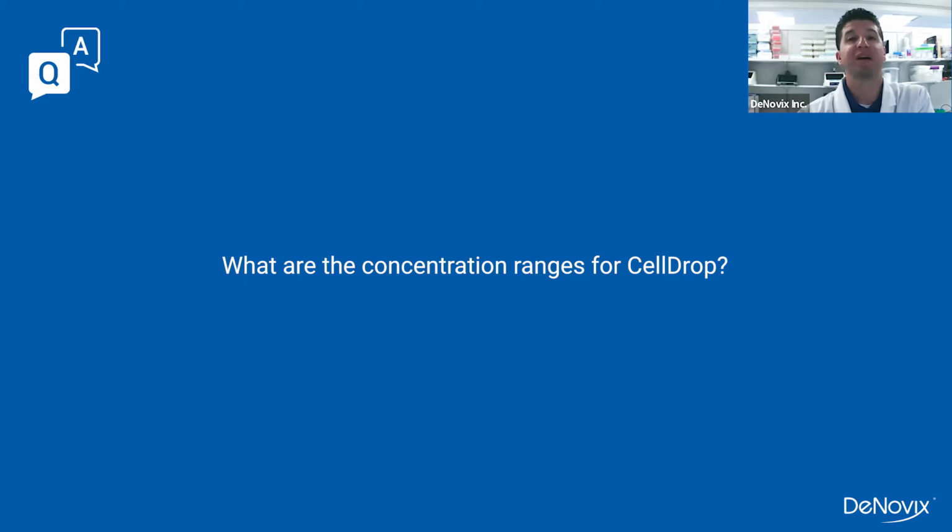So that's 4 times as high as your standard hemocytometer. So instead of 10 microliters there, you would load 40 microliters, which might be less than ideal for a nuclei sample. But those numbers are just based on statistical significance. You can certainly push them, and there's nothing in the CellDrop, no error code or anything that prevents you from using things outside of those ranges. It's just what we've characterized as being linear and cooperating nicely.